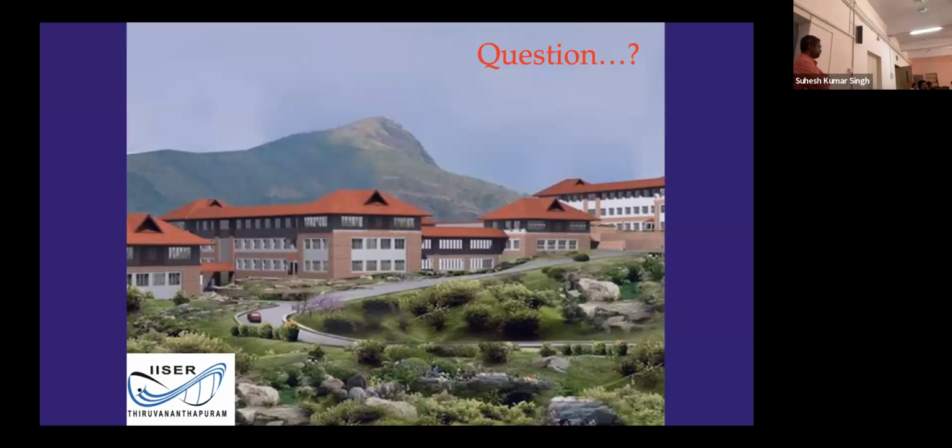So you are seeing the cells like this and detecting. It's still moving a bit. What is the resolution? The pixel size we have, with our cameras, ranges from 3 micrometers to 15 micrometers. So the resolution is set by that, not by the diffraction limit. The diffraction limit is lambda by 2NA, and our pixel size is far bigger than this, so we are not able to reach the diffraction limit.